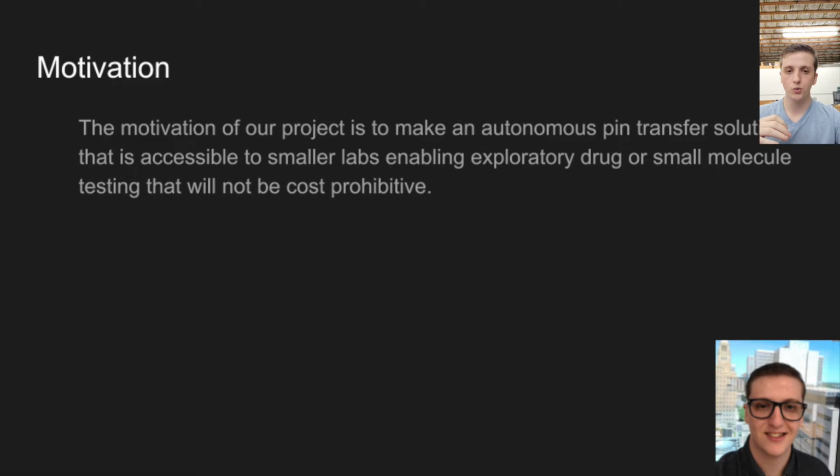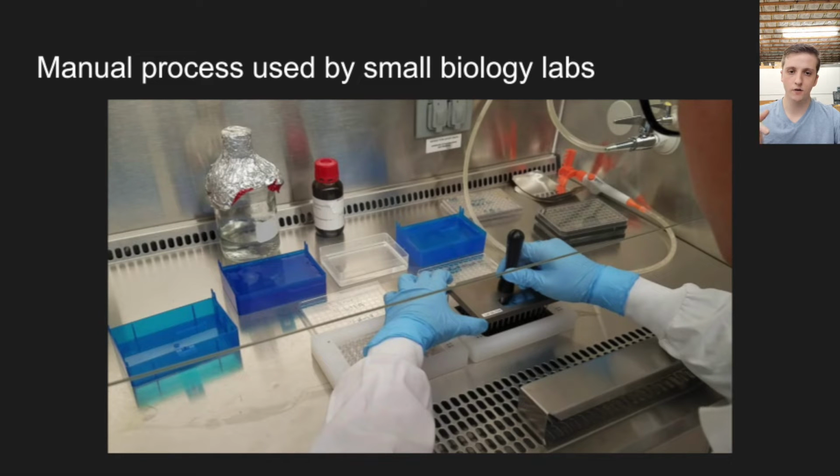Well, a pin tool goes in, one pin goes into each of those wells, and when you dip the pin tool in, it takes a very small amount of whatever liquid was in that well and moves it out, and then you can dip it into another microplate and transfer that. So it puts a very diluted amount of that chemical or solution into a different microplate.